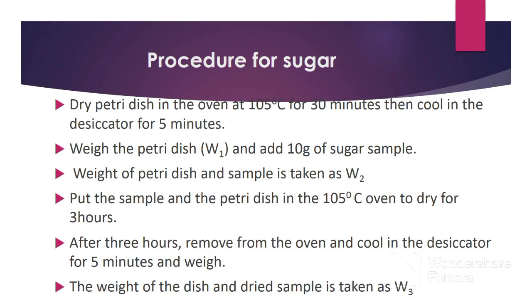Below is the procedure for moisture analysis of a sugar sample. First, dry the petri dish in the oven at 105 degrees Celsius for 30 minutes, then cool in the desiccator for 5 minutes. The reason the petri dish is dried and cooled is to remove any moisture that might be on the dish. Next, weigh the petri dish and record this weight as W1, then add 10 grams of sugar sample and record the weight of the petri dish plus sample as W2. Put the sample and petri dish in the oven to dry for three hours. After three hours, remove the sample and petri dish from the oven, cool in the desiccator for five minutes, and weigh. Record the weight of the dish and dried sample as W3.